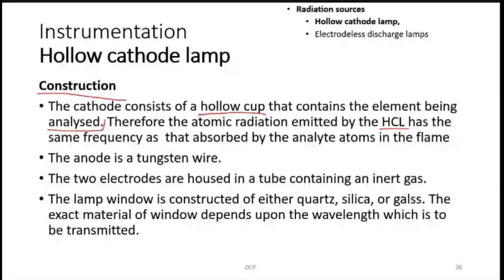Even if it is visible range, you can use glass. If it is in UV region, you have to use quartz. If it is in UV region, you may use fused silica.